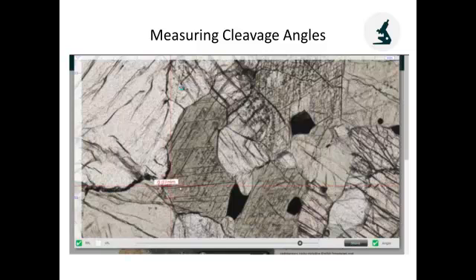Now on the section, click and drag parallel to one of the cleavages. It's actually measuring the size of the grain there as well. Click and drag again and it gives you an angle. So the angle between these two isn't exactly 60 degrees, which you might think about. Why isn't it exactly 60 degrees? It's about 53 degrees in this case. Let's try it again.